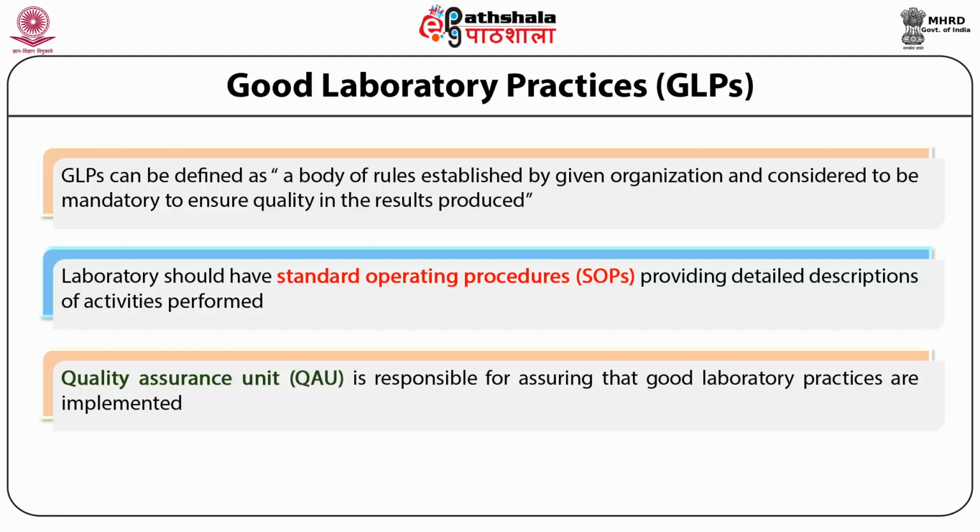Detailed sample analysis procedures are provided for laboratory analysts or technicians. These are generally more detailed than given in scientific publications of developed methods, since the level of training and experience of different laboratory personnel will vary.